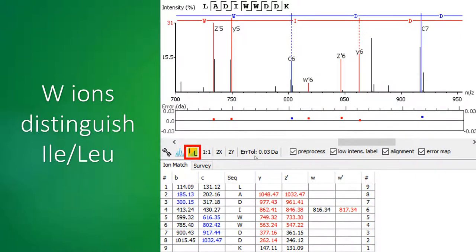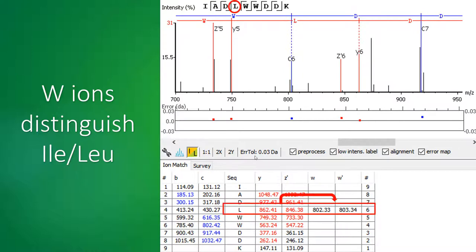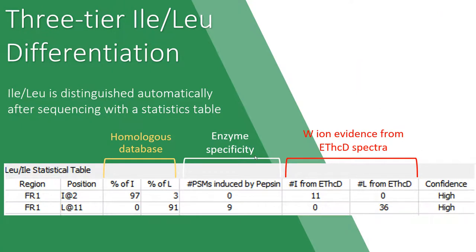Did you notice that there is an IL button below the MS2 spectrum? By clicking it, the IL residues are changed to the opposite in the sequence and the table, and it recalculates the W ion m/z values using the opposite assignment. Now we do not see any peak that supports L. In PICS-AB 2.0, after the protein sequence is constructed, the IL assignments are automatically made considering W ion evidence from ETHCD spectra, enzyme specificity, and homolog database information. This IL statistical table is provided in the result.